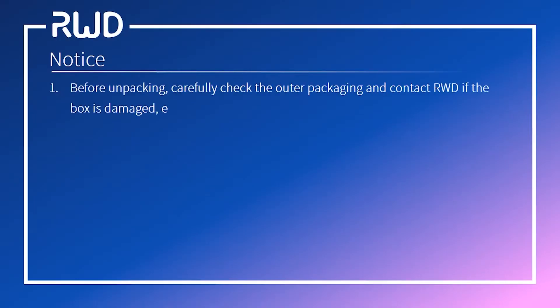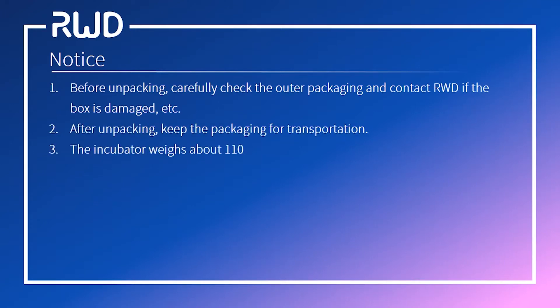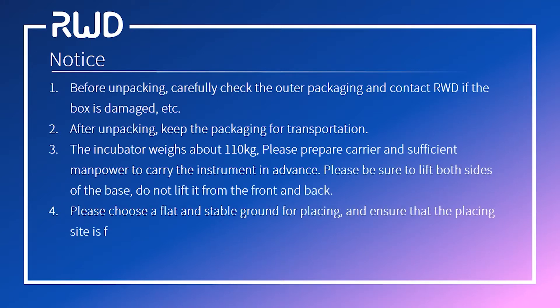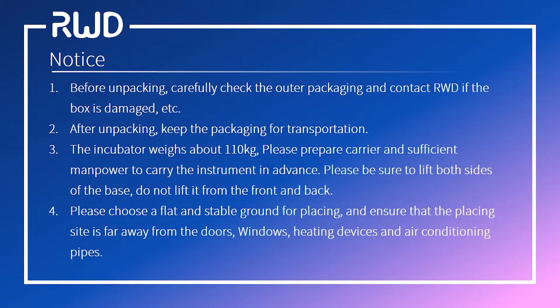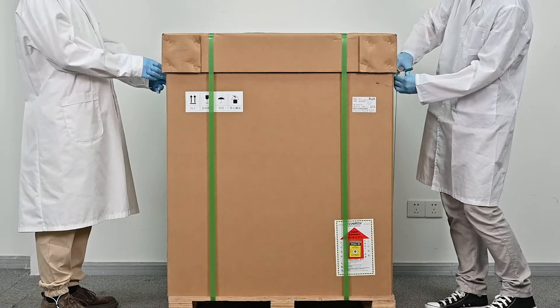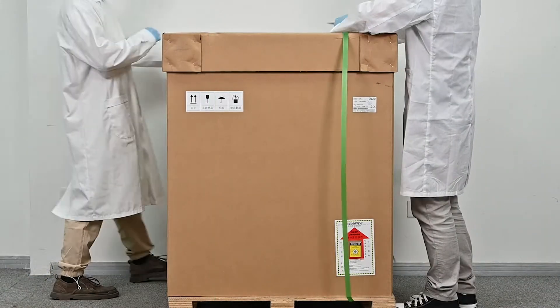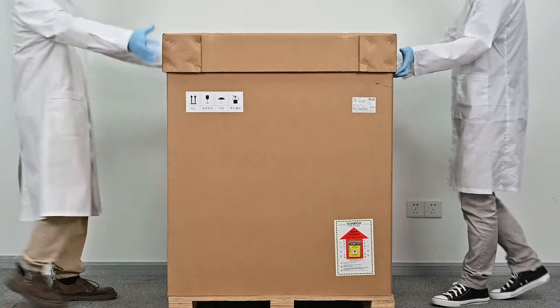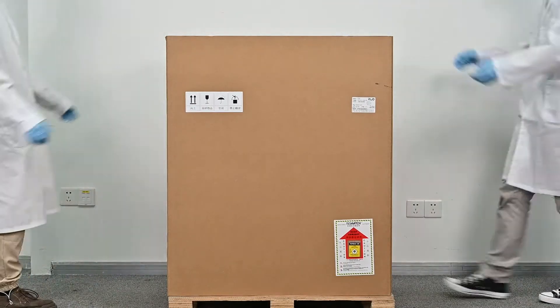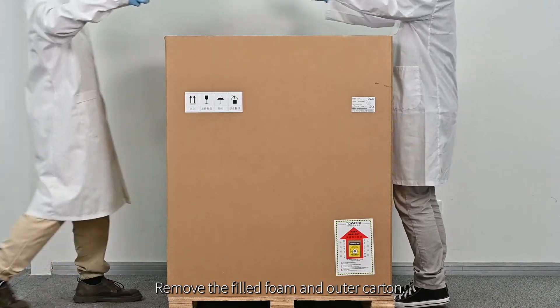Please pay attention to the following before unpacking. If the package is intact, open the outer packaging. Cut four straps and remove the lid. Remove the filled foam and outer carton.